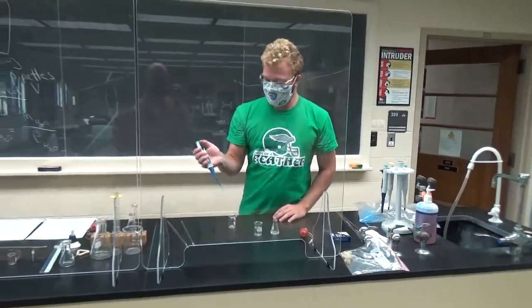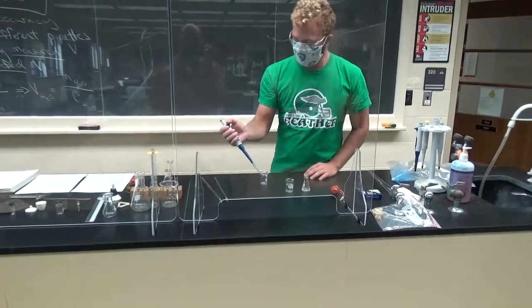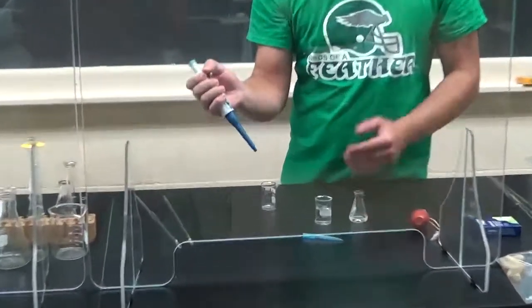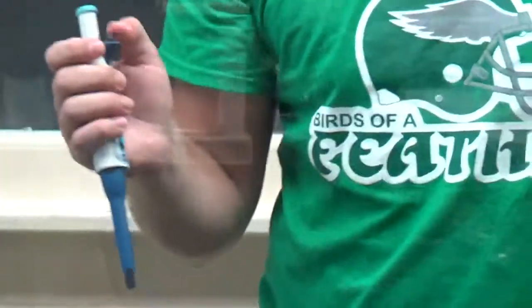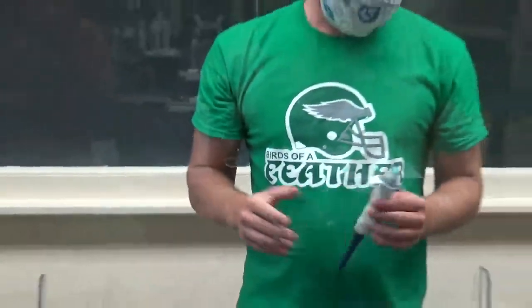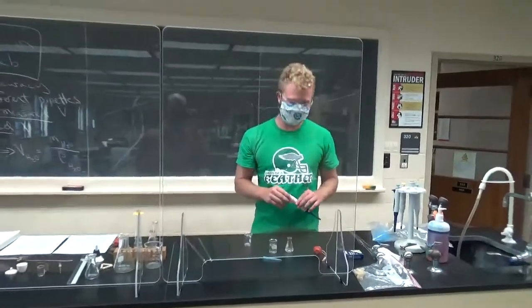If you were going to remove the pipette tip there, there's a little dispensing feature here. Some of them it works. These ones are like the newer pipettes. That's that tab in the front. I think I didn't miss it, but that's okay. I'll get better at recording these.